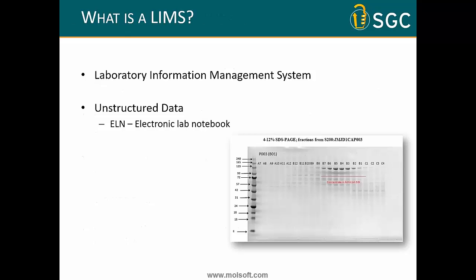I want to spend a bit of time just framing what a LIMS is and what I mean by the data management that I've been talking about so far. And for those of you in industry, or biotech, none of this will be a surprise to you, and maybe for some of you in academia, none of this will be a surprise to you. But I just want to frame this out and make it clear what I mean by some of the terms I'm going to use in the rest of this presentation.